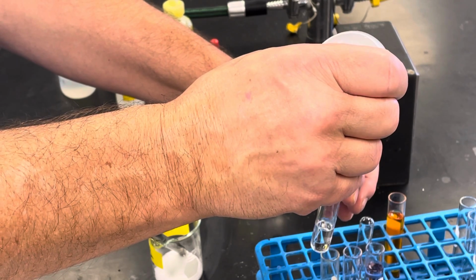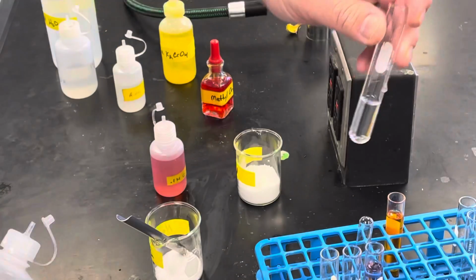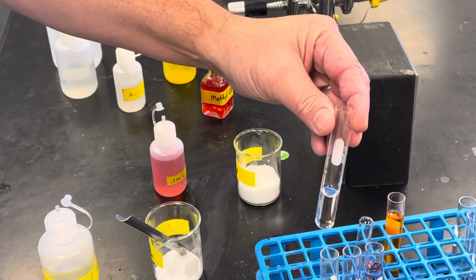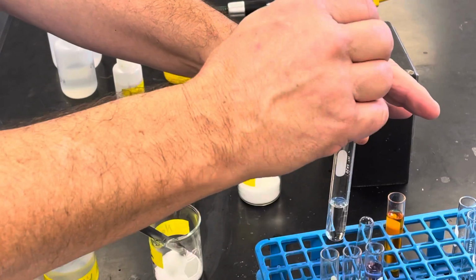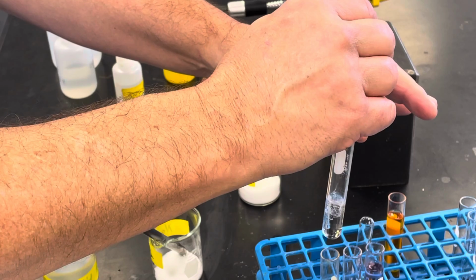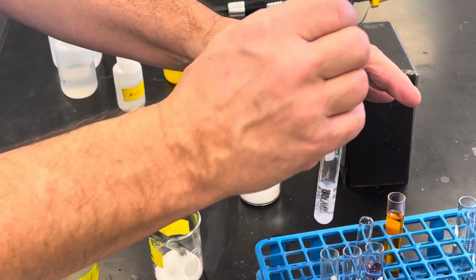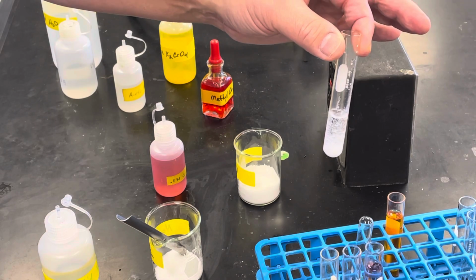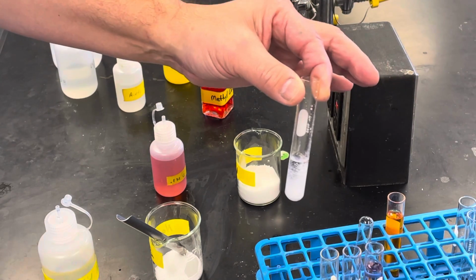I need a faster drip bottle. Okay, so there's about 3 milliliters. We're going to take some more of the concentrated HCl. Now, kind of watch it carefully as I put this into here. You can see it looks kind of like it's snowing. Okay? So a white solid is being formed.